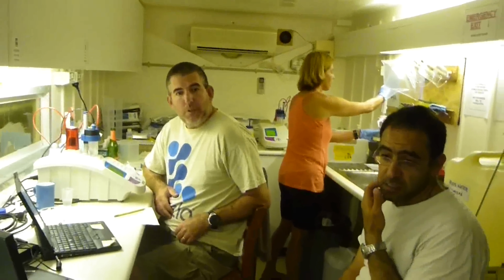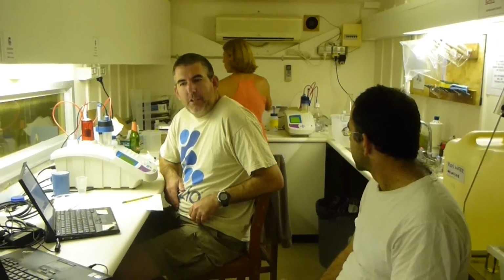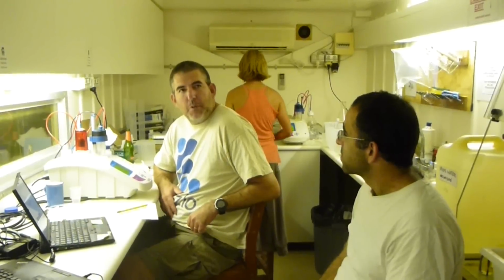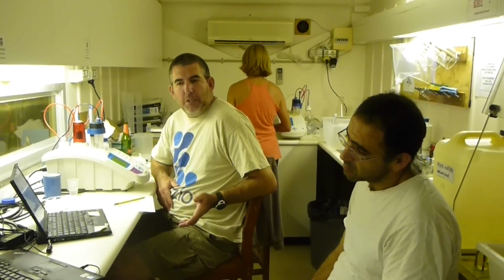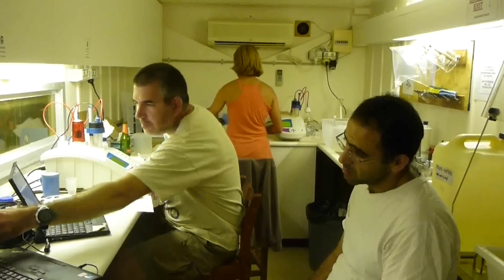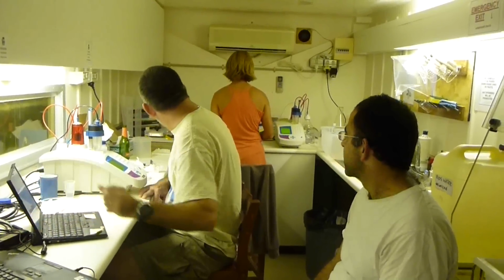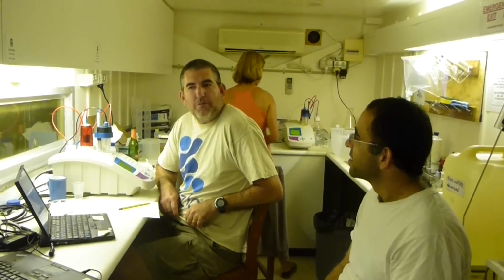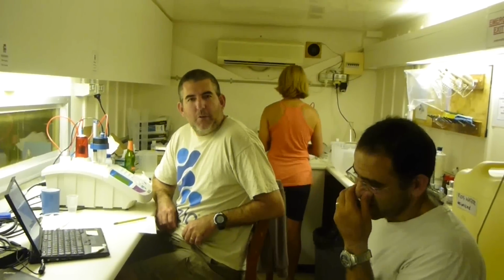So how are you measuring pH of samples? Well, we can measure pH on this machine, but we usually measure it on the other machine. We have approximately the same sort of setup: a pH glass electrode with a temperature probe built in, and we calibrate the pH electrode with regular buffers. Here we go, this is buffer 7, it's yellow, and buffer 10, the blue one. Then we let the electrode sit in seawater for about half an hour to get sensitized enough to seawater, and then we start measuring. It's a very quick process, about 1 or 2 minutes per sample, and we can go through all the samples in a couple of hours. Just dip the electrode and get the measurement.